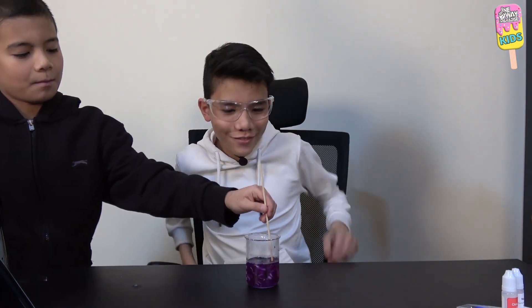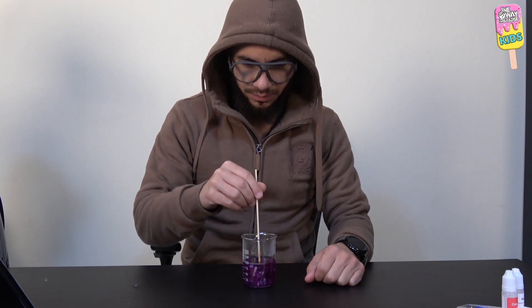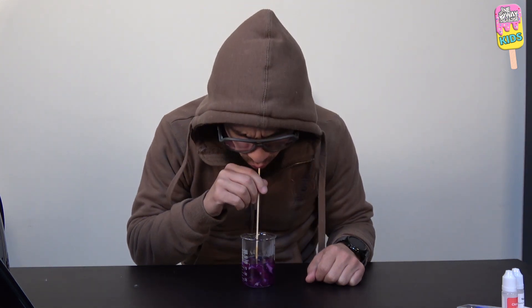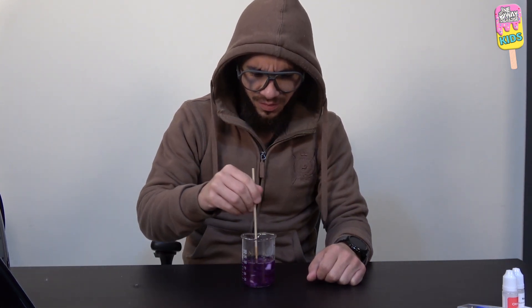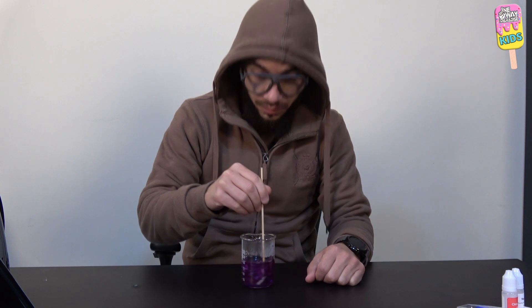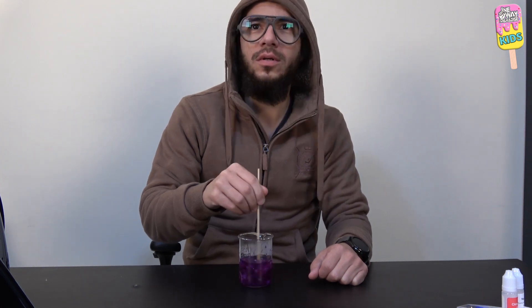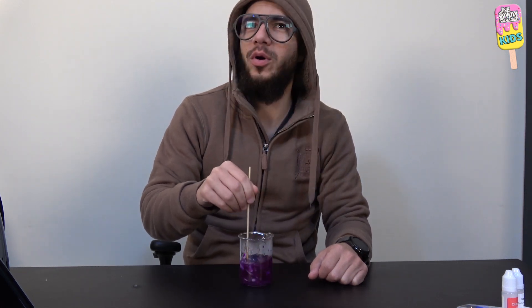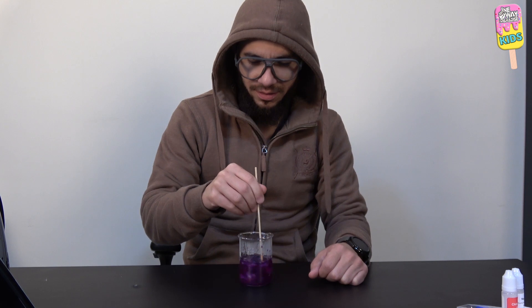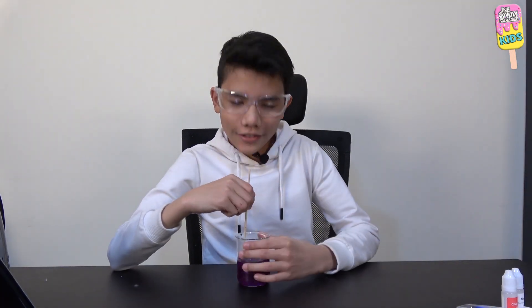Mix, mix, mix, mix more. Oh it's a stick — it's not a straw! Look, it's a tornado! What do you call this in the water — a whirlpool? Whirlpool is a brand of electronics — it's a whirlpool, whatever. It stinks! Oh, it does kind of stink.